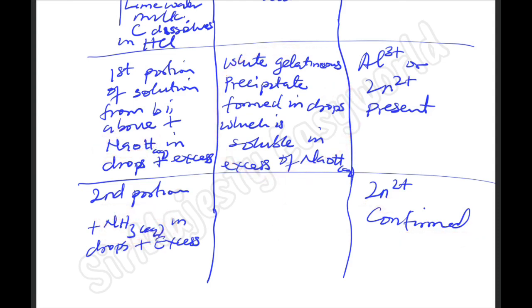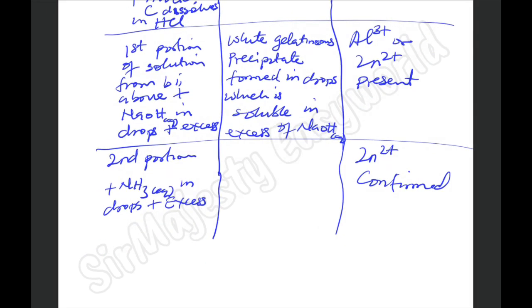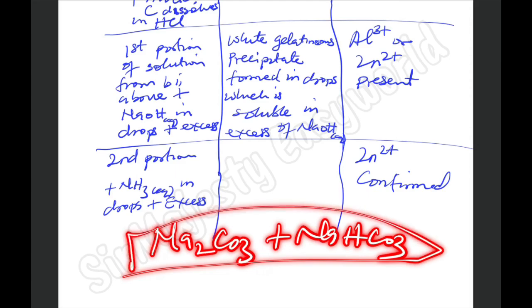Okay, so this is it for the practical guide on titration and this salt analysis. Also learn how to distinguish between sodium trioxocarbonate(IV) and sodium hydrogen trioxocarbonate(IV). I have a video on that on this channel. I've told you how to distinguish one. There will be action of it. Phenolphthalein is what I mentioned here, so just go for the detailed video.